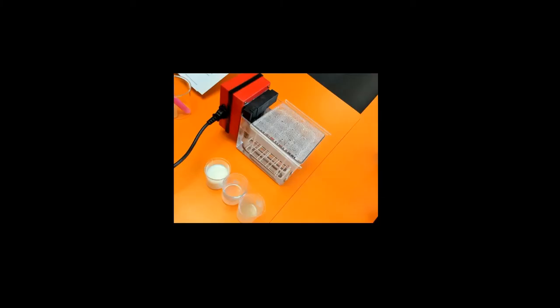In this video we're going to look at the decomposition required practical. We're going to look at the effect of different temperatures on the breakdown of fats by lipase.